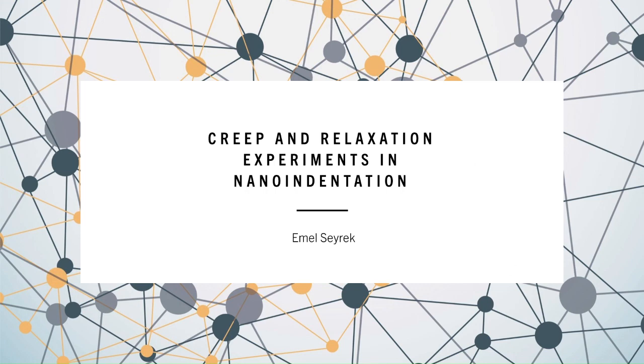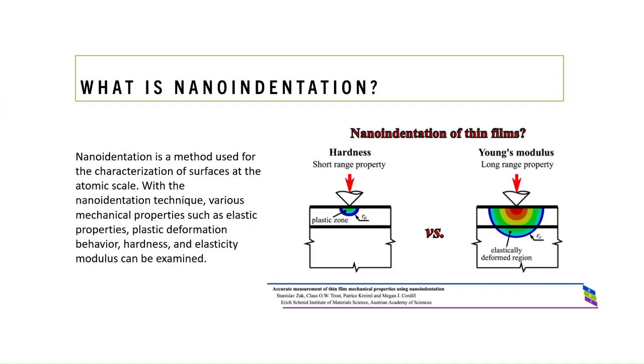Hello, in this presentation I will explain the creep and relaxation test in nanoindentation. But first I would like to briefly mention nanoindentation. Nanoindentation is a method used for characterization of the surface at the atomic scales.